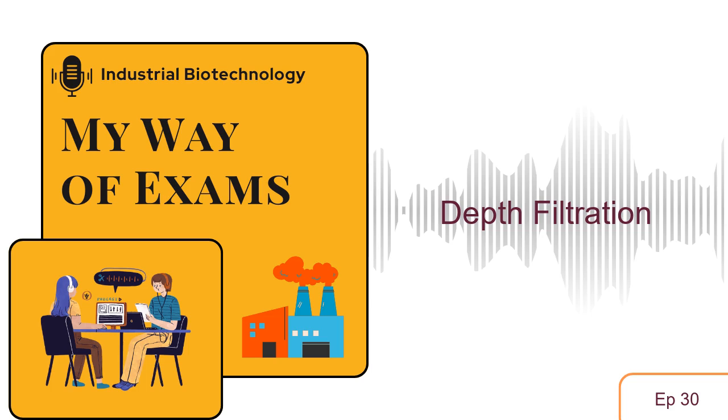Sounds pretty awesome. But are there any limitations to this technique? There's got to be some downsides, right? Well, yeah, there are some things to keep in mind. Compared to something like a membrane filter, the separation isn't quite as precise, especially when it comes to very fine particles. You might still have some small bits slipping through. And it's not a sterilization method, so it won't remove all microorganisms. Okay, so you can't rely on it to create a totally sterile product.